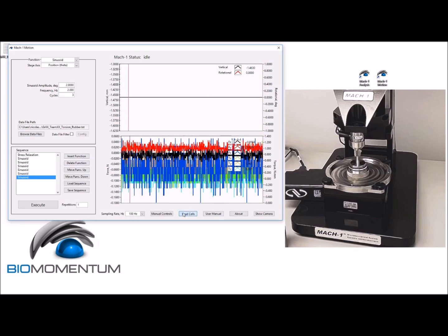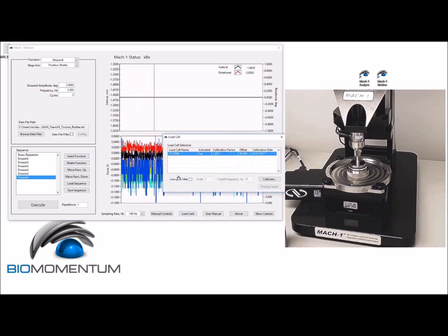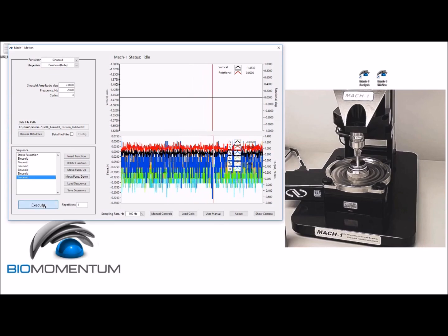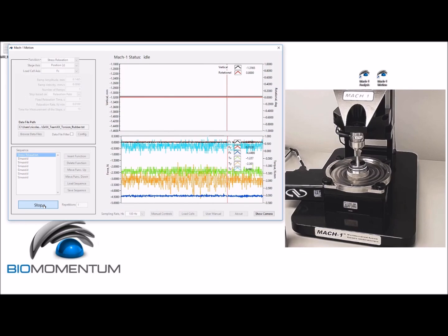Ensure that the low pass filter is unchecked in the load cell window since this filter could create a small phase shift at high frequency. Now let's execute the sequence. So here is the pre-compression of the rubber sample.